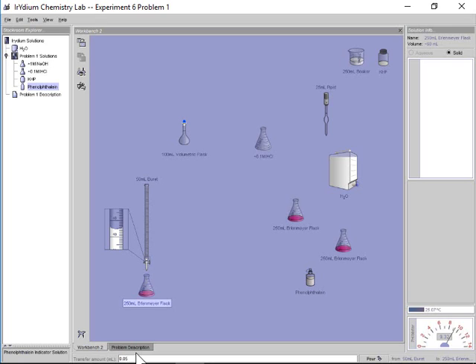That's our perfect endpoint. When the first color change happens, we're going to take our reading here. And this one here says 48. We're going really close to the end of the burette here. 48.55 plus minus 0.05. We're going to switch over one last time to the OneNote.